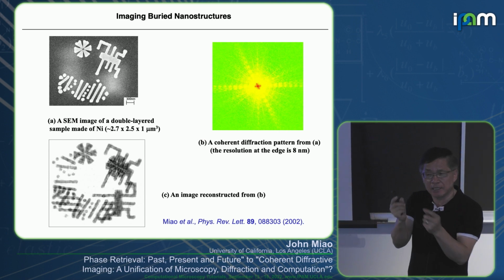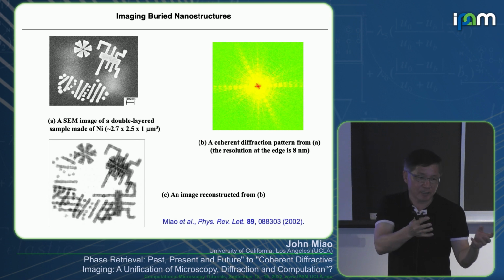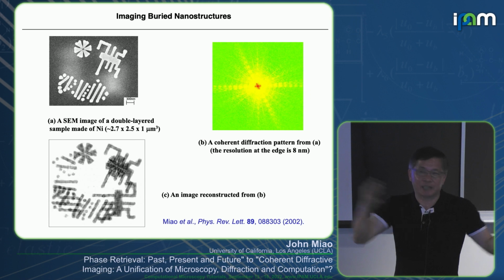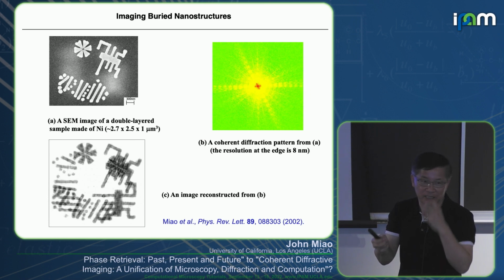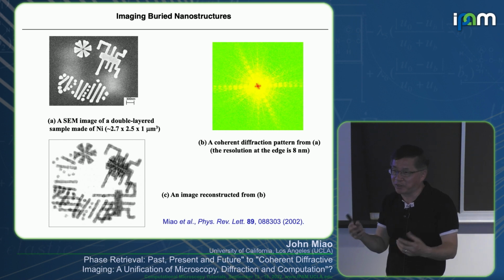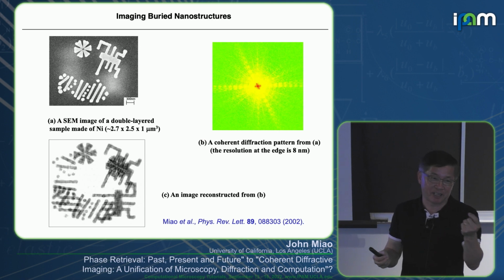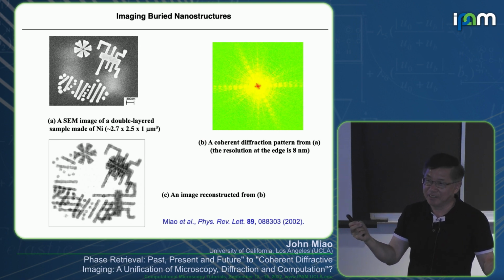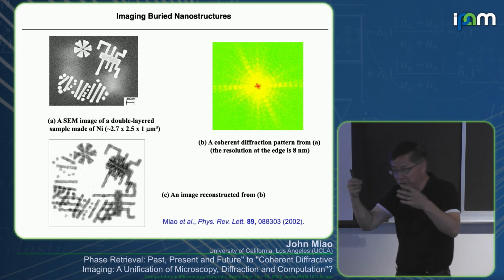You can see the history of the evolution of this field, right? In the early days you needed a large crystal. The X-ray was so weak, just an X-ray generator, so you needed a large crystal to get interference. Then X-rays got stronger and stronger, and the crystals got smaller and smaller. What I want is just one unit cell, not a crystal, right? A lot of objects are not crystals. So you need to get it smaller and smaller.